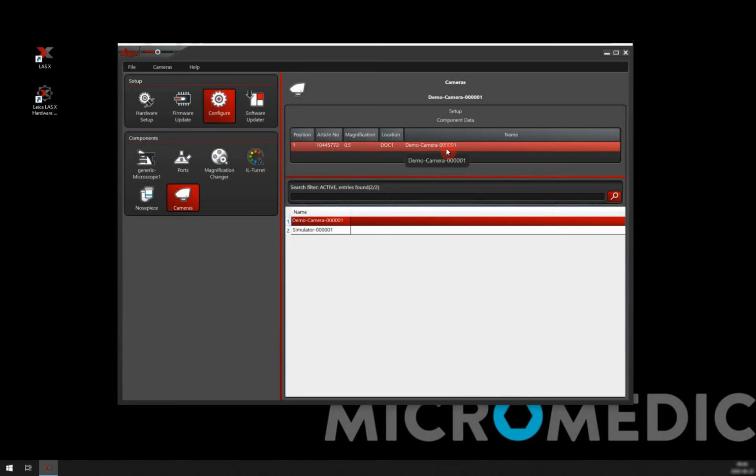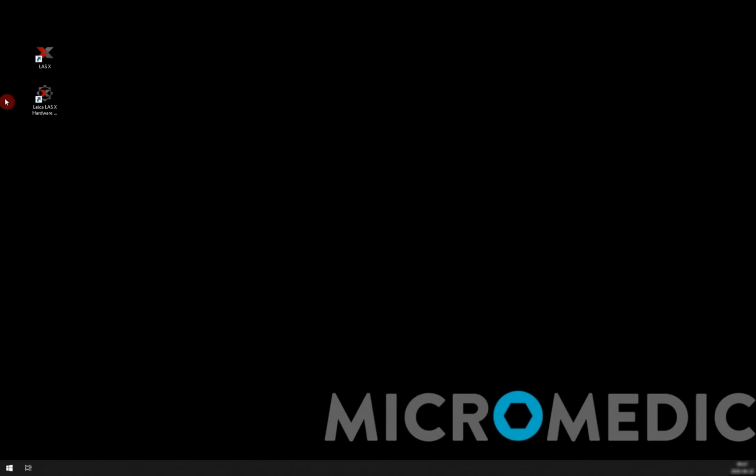All right, so that's it. We have told the system what type of microscope we have, and we have also informed the system what configuration, so what objectives and filters and so on we have on it. So we are good to go. I'm gonna close down the hardware configurator, and we are ready to start LAS X.